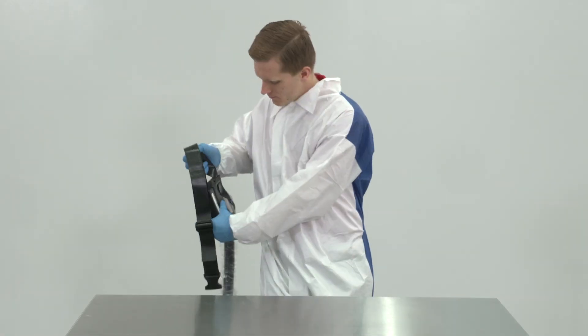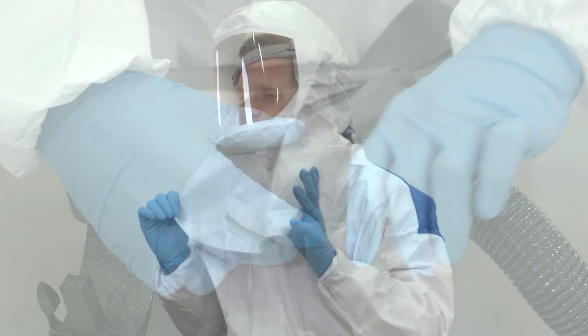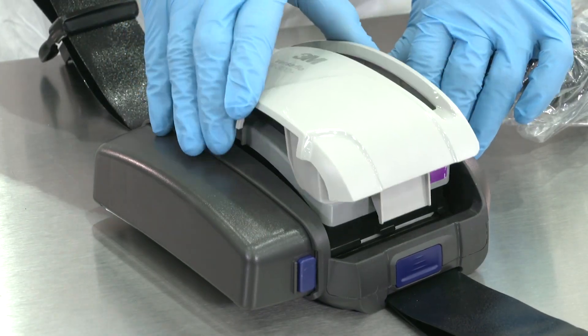The 3M Versaflow TR300N is easy to assemble and can be ready to use in minutes. Easy cleaning and filter replacement keeps you protected and productive.